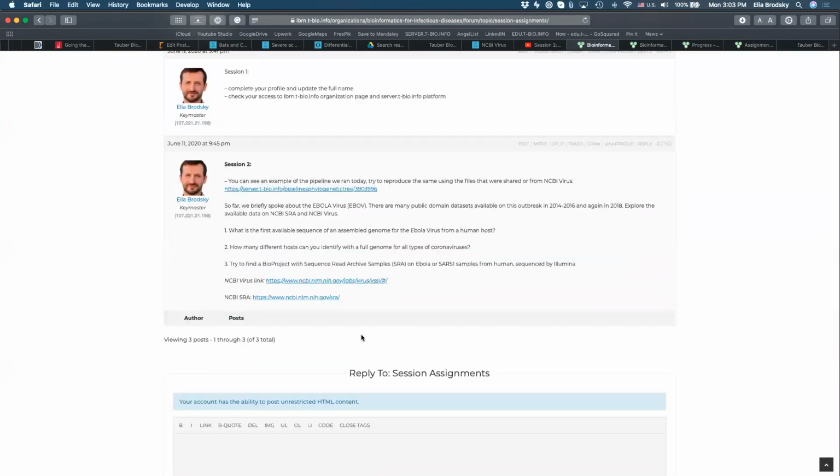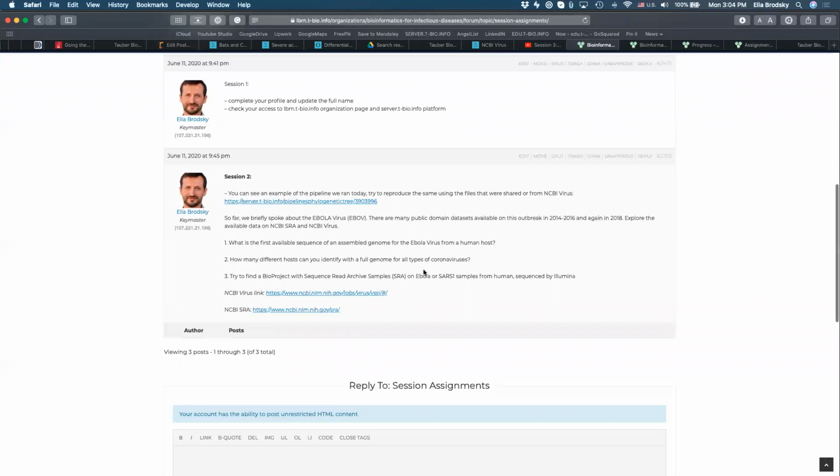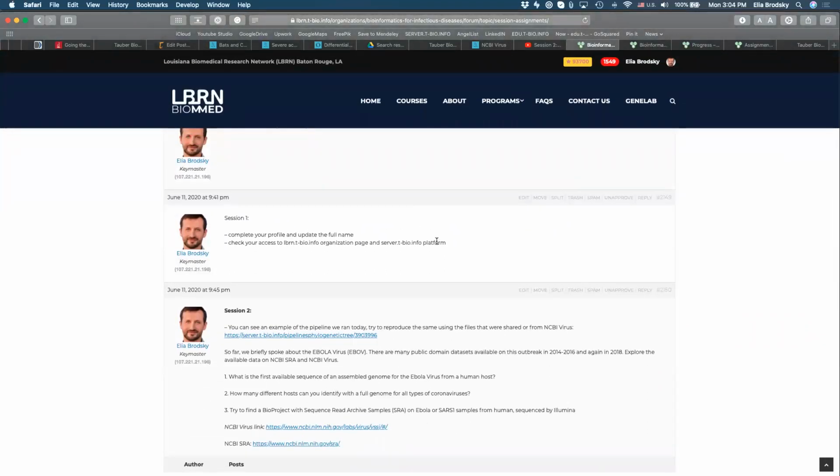And then last time, we started talking about the Ebola virus. We looked at several of the publicly available data sets on the outbreak from 2014 to 2016, and even saw some new sequences from the 2018 outbreak. So the purpose of that discussion was to get you to look at NCBI Virus and NCBI Sequence Read Archive, and to try to think about a couple of these questions. So the best way, again, to post any topics that you would like discussed, any questions that you have, or technical issues, is to do it there.